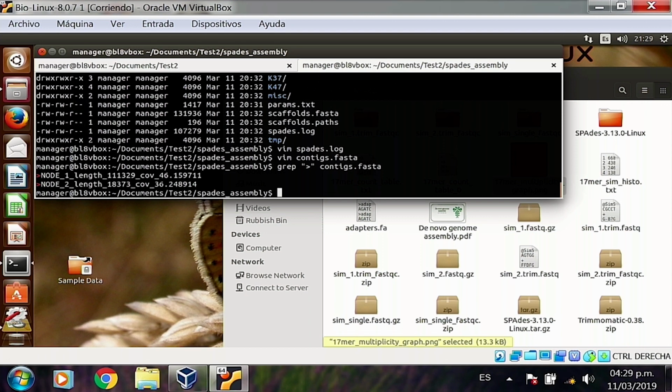But what if we didn't have those characteristics? How do we explore a sequence without knowing if the names don't actually help us? What if the assembler had named them just contig 1 and contig 2, and that's it, no further information in the name? It is possible. Some assemblers do that. How do we know basic statistics about what is inside my sequences?